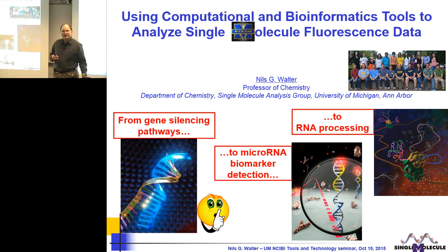But more recently, and this is what I want to focus on today, we have worked on a number of other bioinformatics-related tools in order to analyze big data from experiment, from single molecule fluorescence observation. And so that's the topic of our talk today.